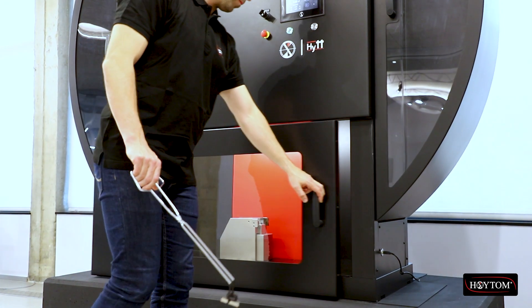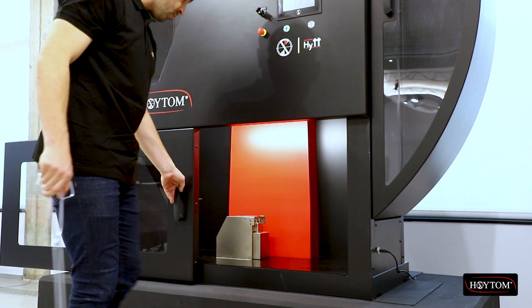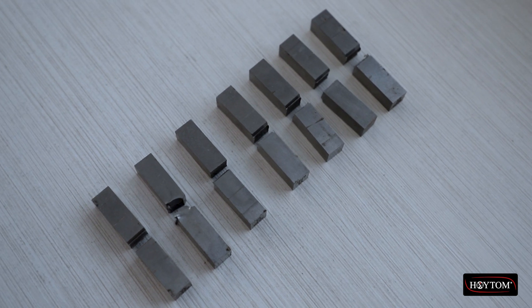In addition, the easy to open and close sliding door, with the option to launch a test by simply closing the door, enables fast test cycles — very common when testing temperature controlled test specimens according to the ASTM international standard.